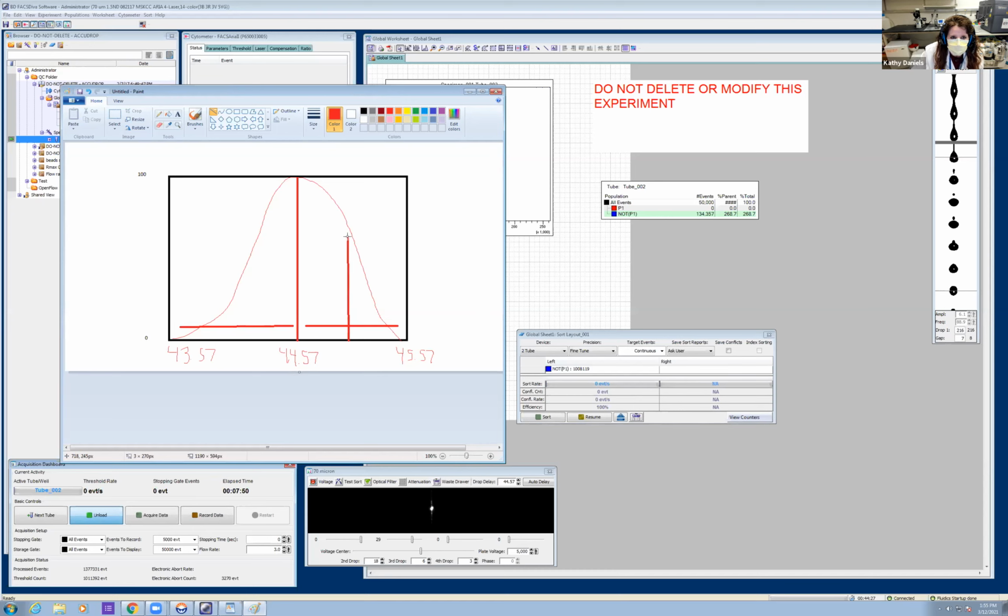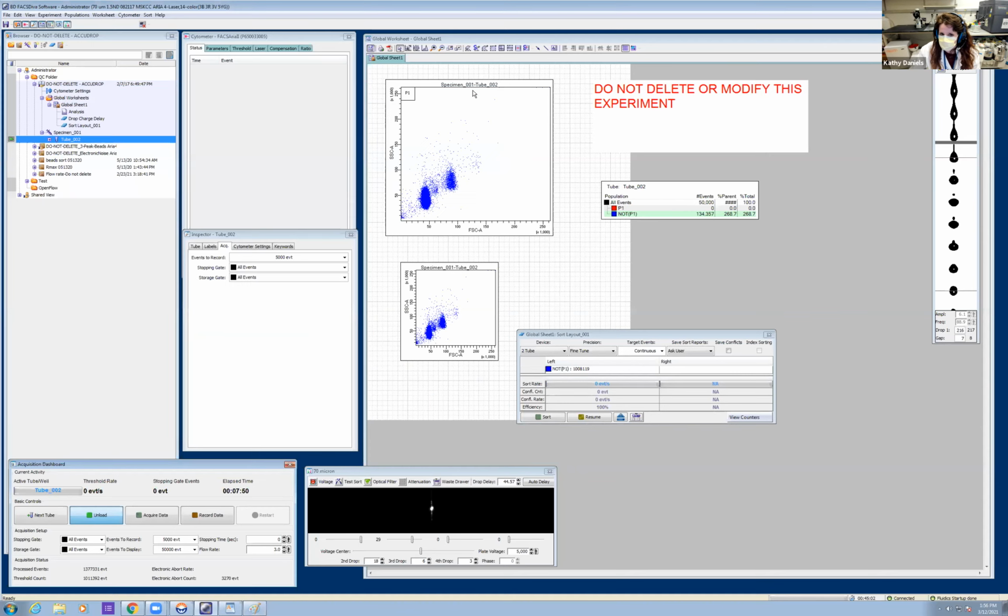So if I were to try about 44.7 or something like that, I would see a value showing up in the left, probably somewhere around 70. You can use that to your advantage to start making minor adjustments to that drop charge delay. Essentially this is what's happening as it's doing its auto delay, calculating all of that for you. If you get a deeper understanding of what's going on, you could make quicker changes and calculate that drop charge delay yourself. So we do manual, but you can do automatic.